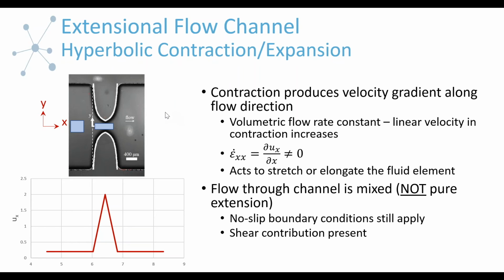Okay, maximum. So we have a question about the maximum syringe volume for the e-VROC, and I believe 10 milliliters is the maximum volume that we have for that. Okay, yeah, so 10 milliliters.